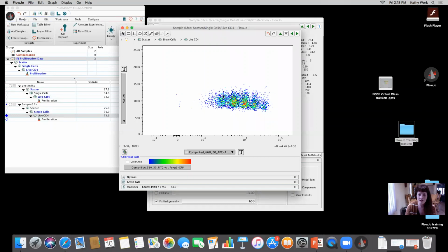You can see how these are nice and tight and have a CV of around 3.3. I'm saying it's a nice tight CV; I can't tell you that you would know that it's 3.33. But this population right here is very real, and you wouldn't expect this last population to just be a smear and a spread. We assume that it's going to be a similar CV of 3.3, given the way that the cells distribute the dye, and it pulls in half.